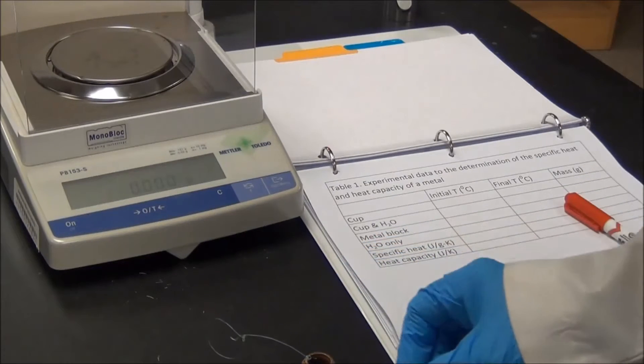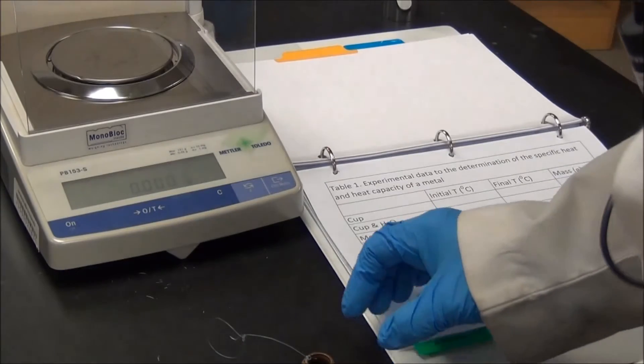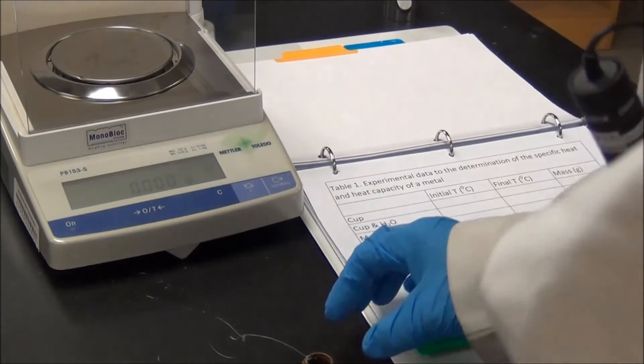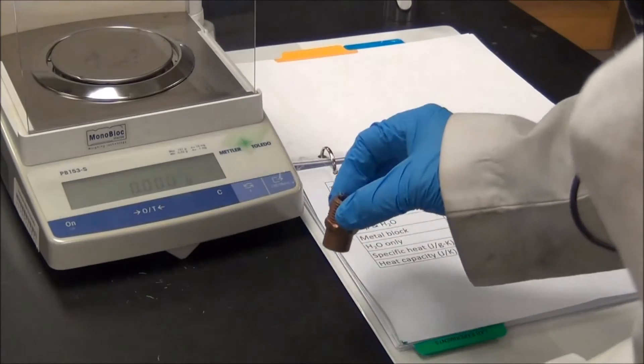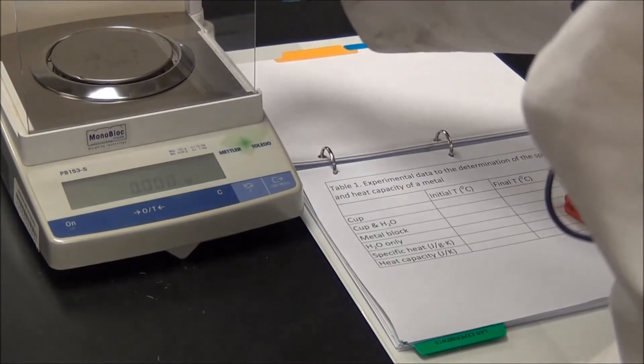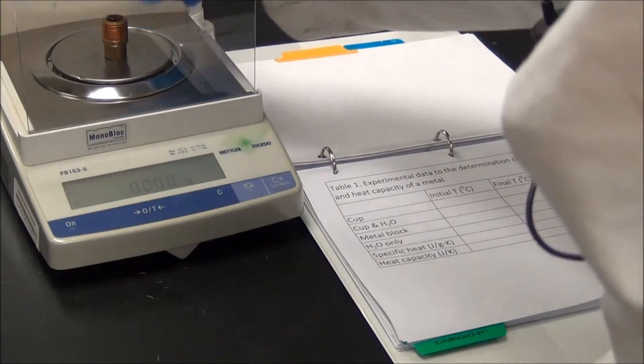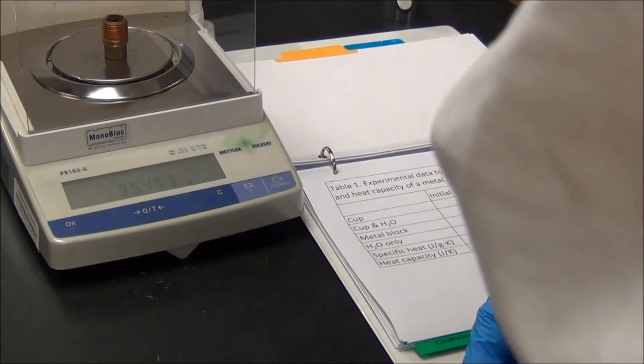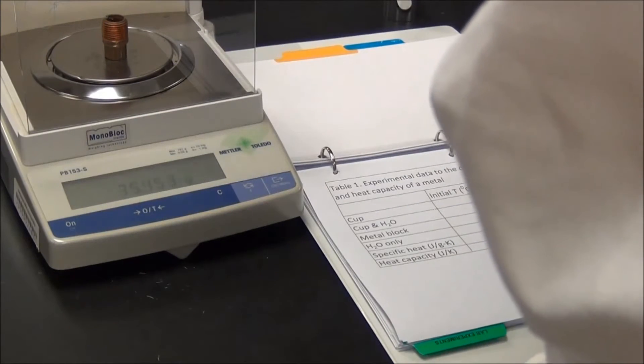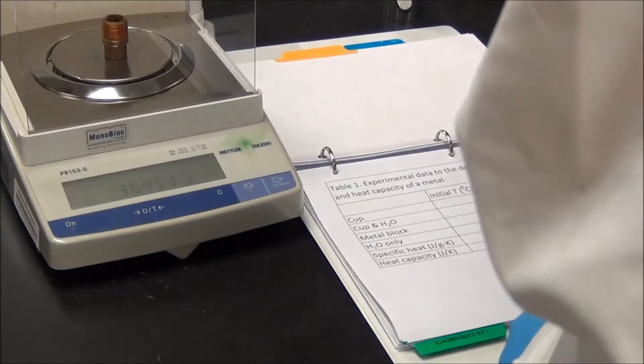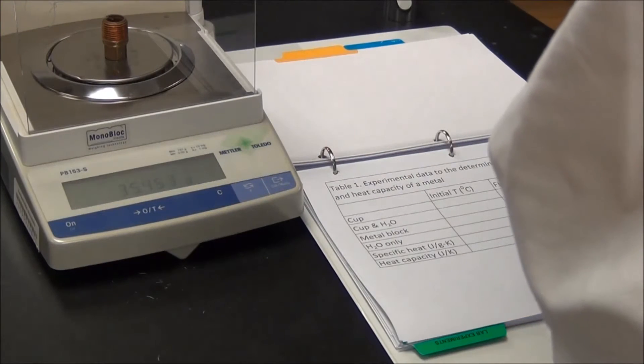And after it is turned on, the reading is 0.000 grams. Now it's time for us to make our measurement. We can place our metal piece on top of the balance. And then it reads 35.453.